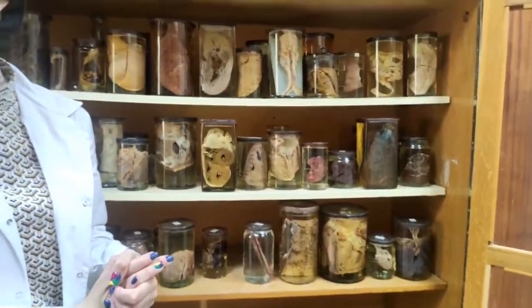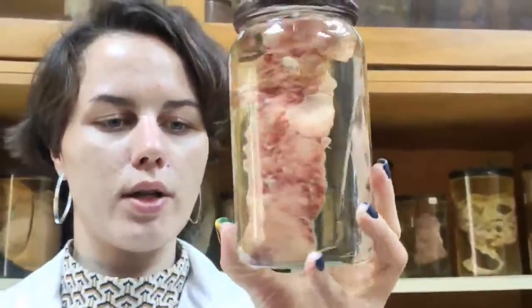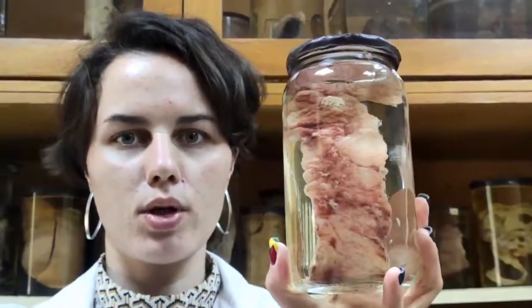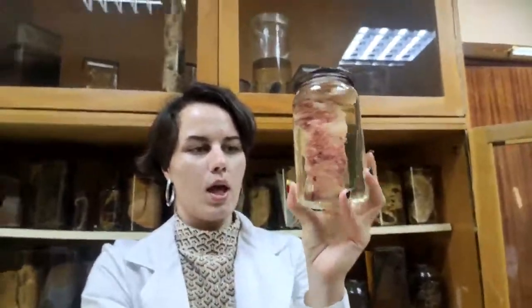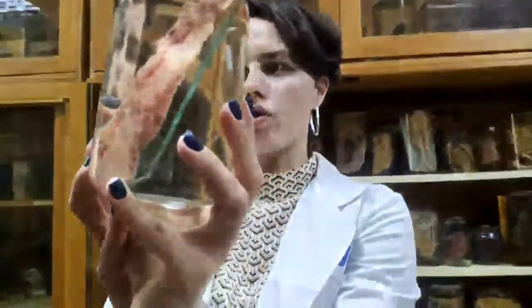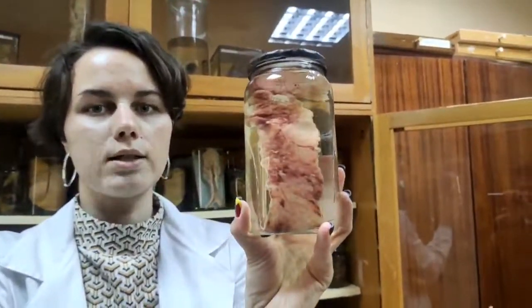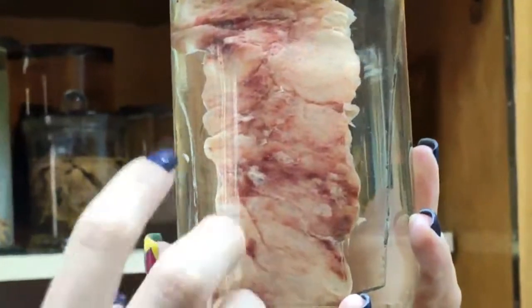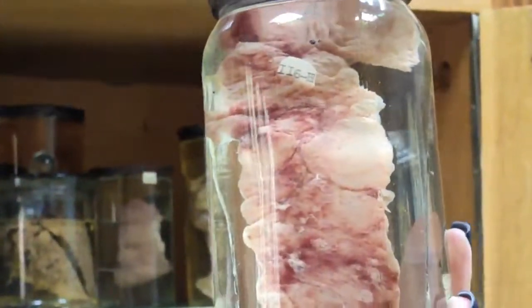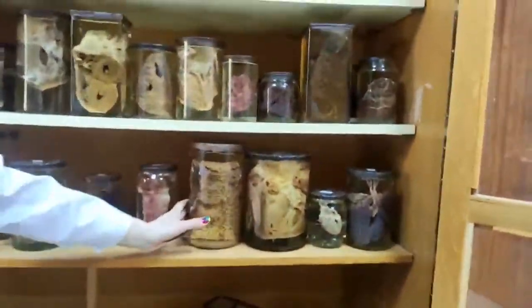Where can you find hemorrhagic inflammation? Colon in Escherichia coli infection. Escherichia coli infection is characterized by development of pneumatosis in the colon. That means that a lot of air concentrates in the wall, and you can see it like bubbles on the surface. Besides, you can see hemorrhagic spots, somewhere catarrhal inflammation, so there is a contrast between catarrhal inflammation, hemorrhagic spots, erosions, and this accumulation of air.